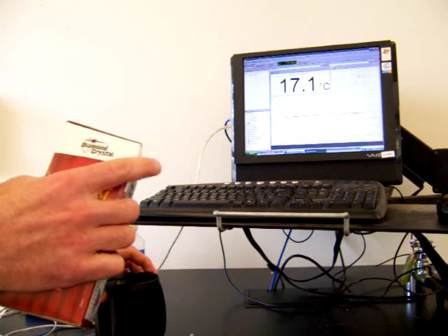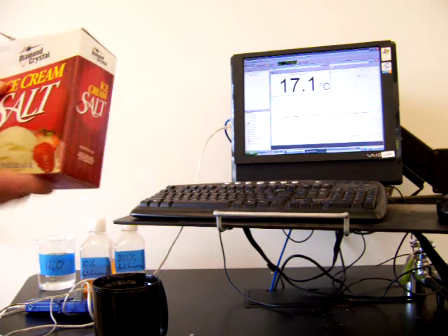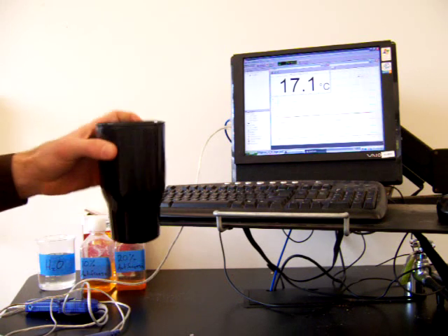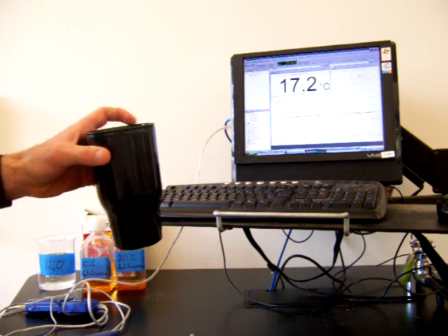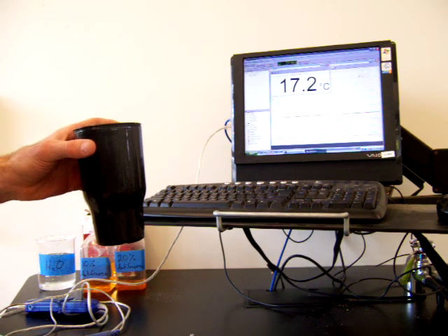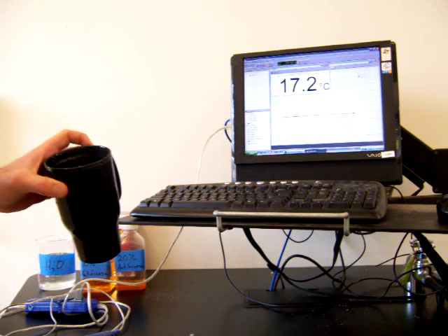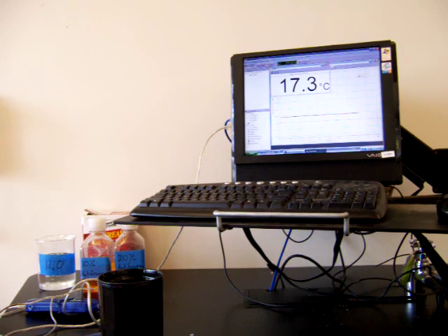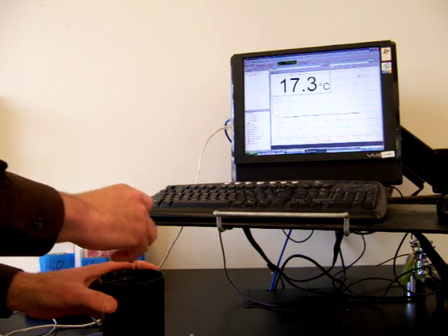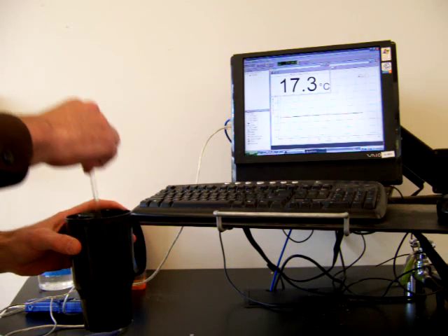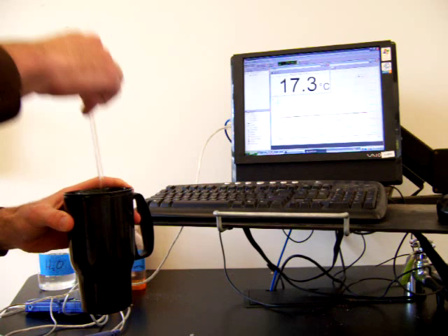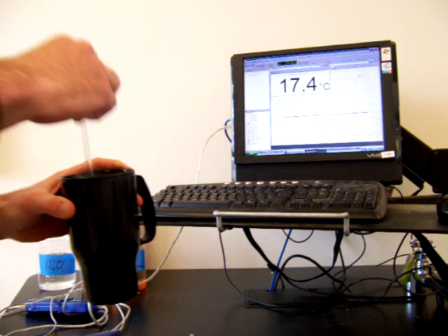Rock salt like you use for making ice cream in an old fashioned ice cream maker. The salt is going to lower the freezing point of the water in the ice. As the ice melts, it's going to absorb heat from the surroundings and get extremely cold. So this is an ice bath that will be very cold, probably around negative 15 degrees Celsius. It will be cold enough to freeze our antifreeze solution.